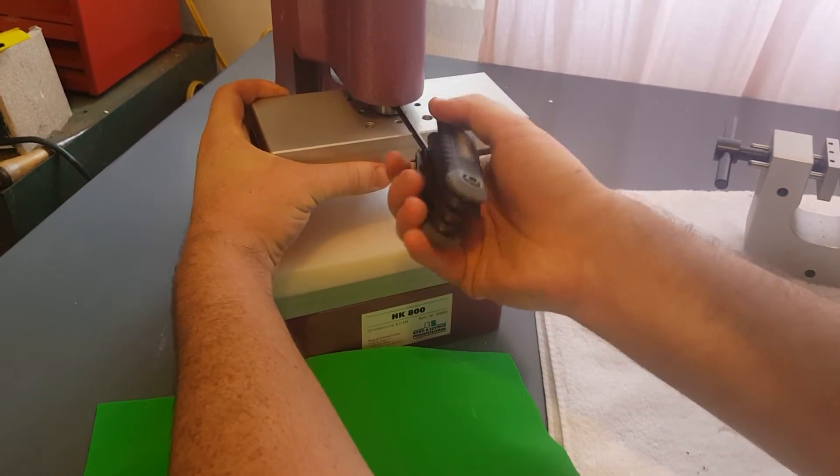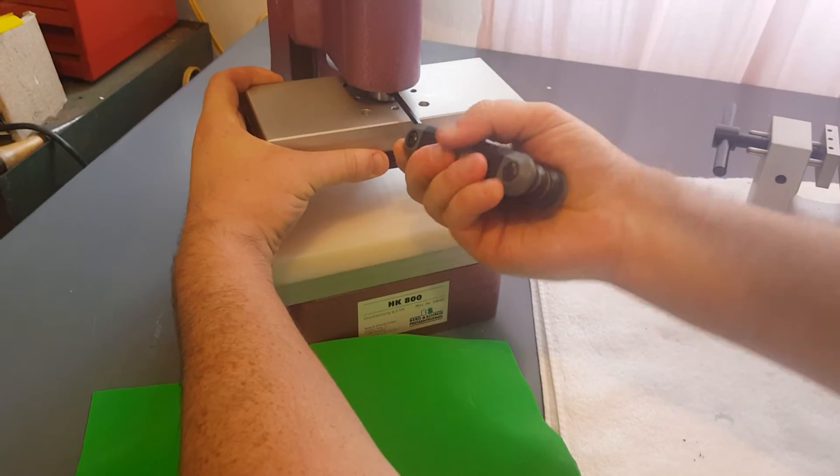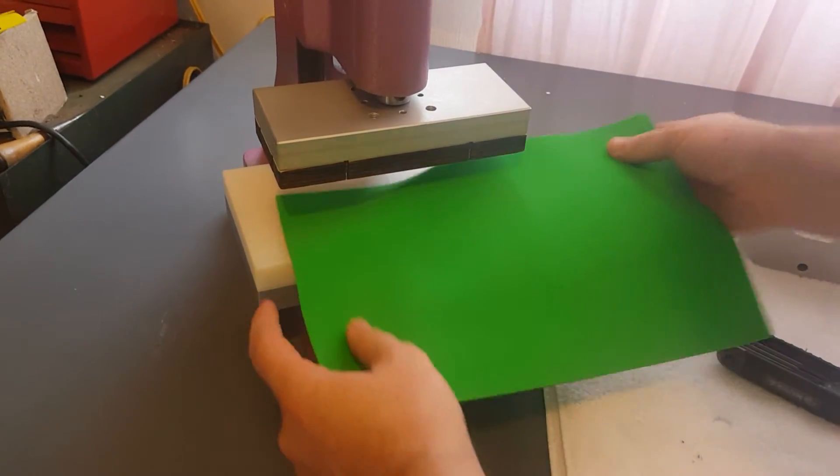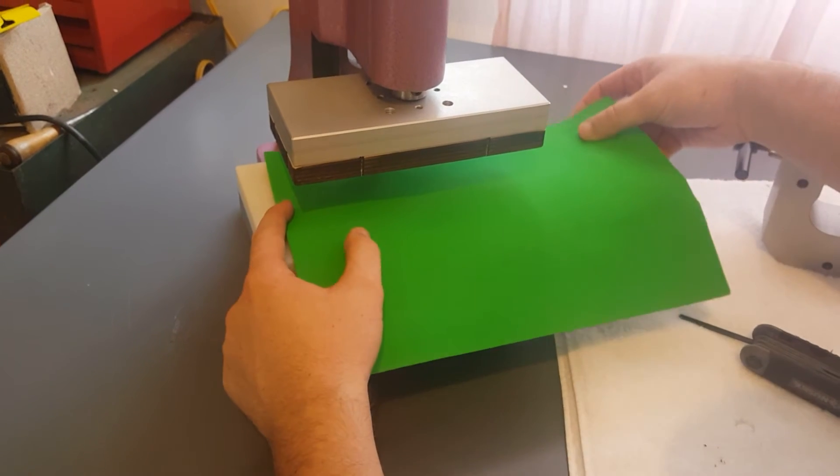Go ahead and secure this on with the screw. There we go. Now we have our sample rubber material that we're going to cut to make a sample.